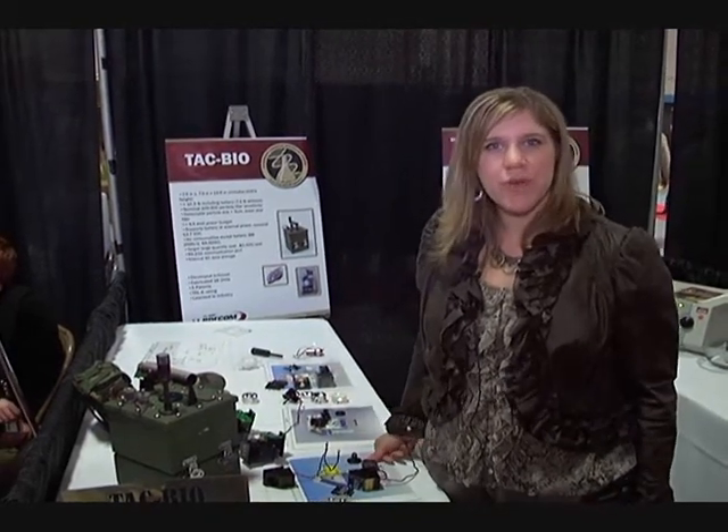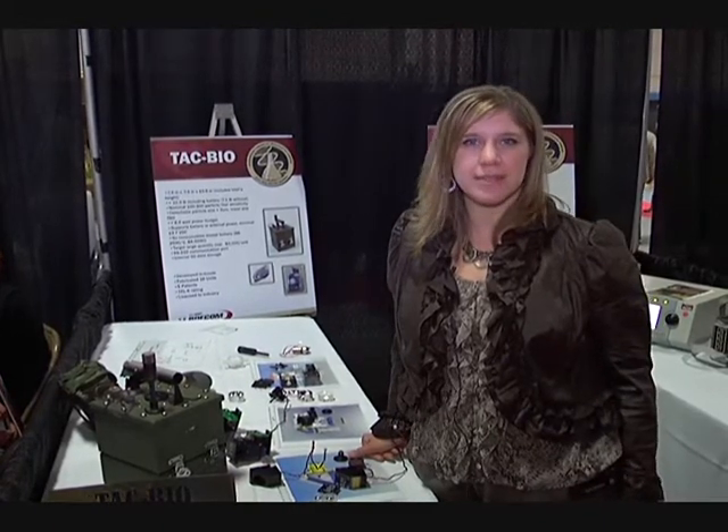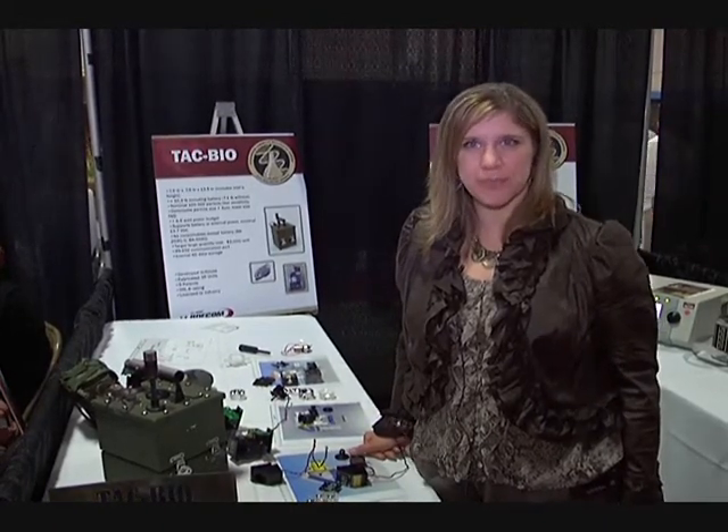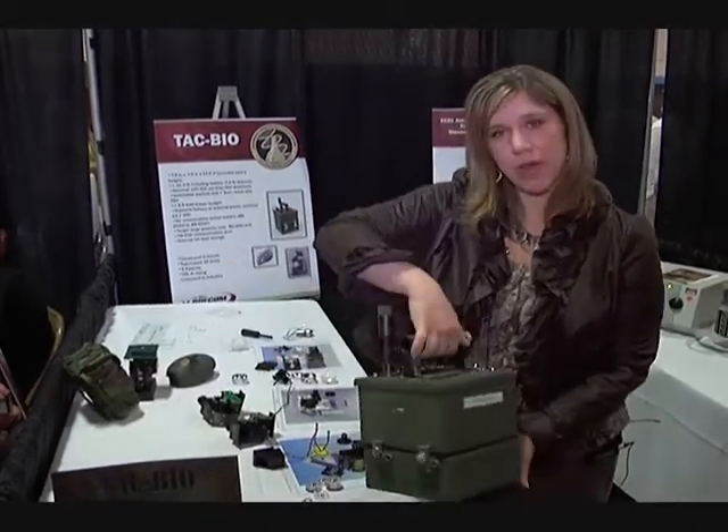Hi, my name is Ima Goad from ECBC. I work in the CV Systems Integration Team in the Physics and Computational Science Division. Today I'm going to talk to you about the TAC Biodetector, which is right here.